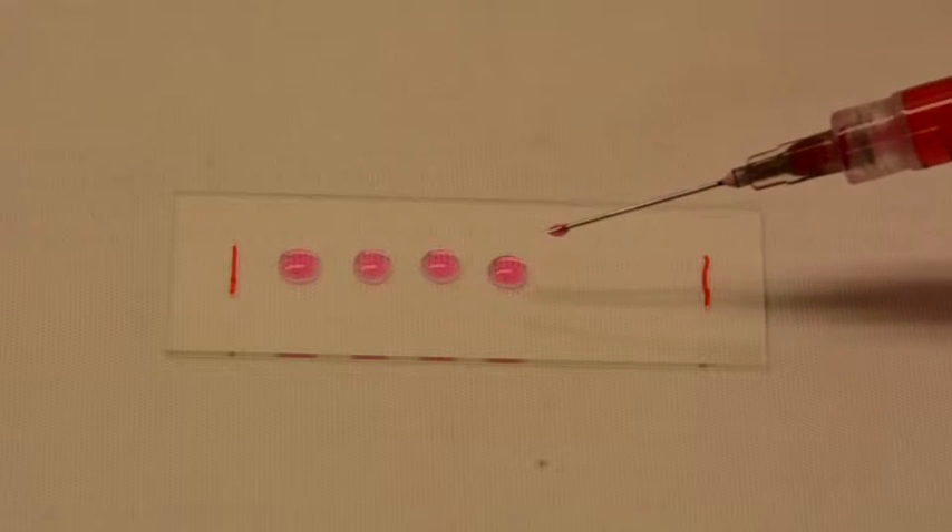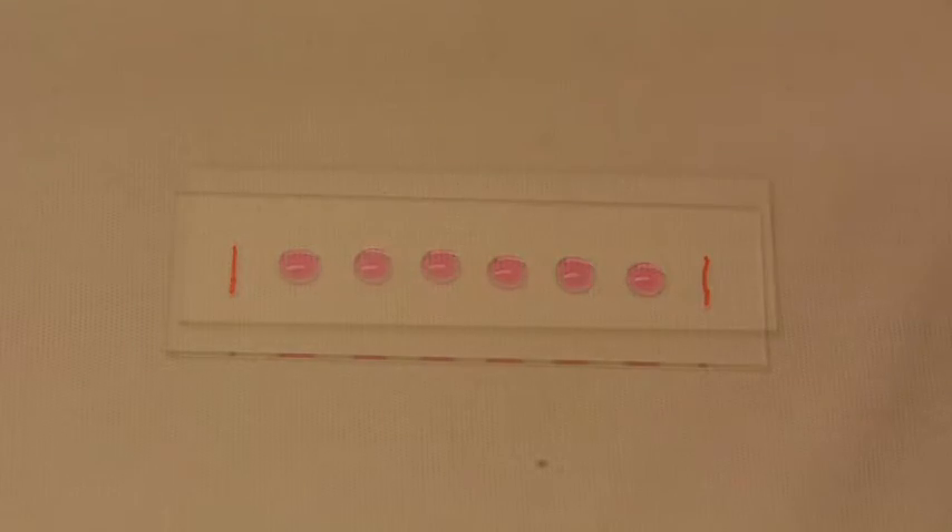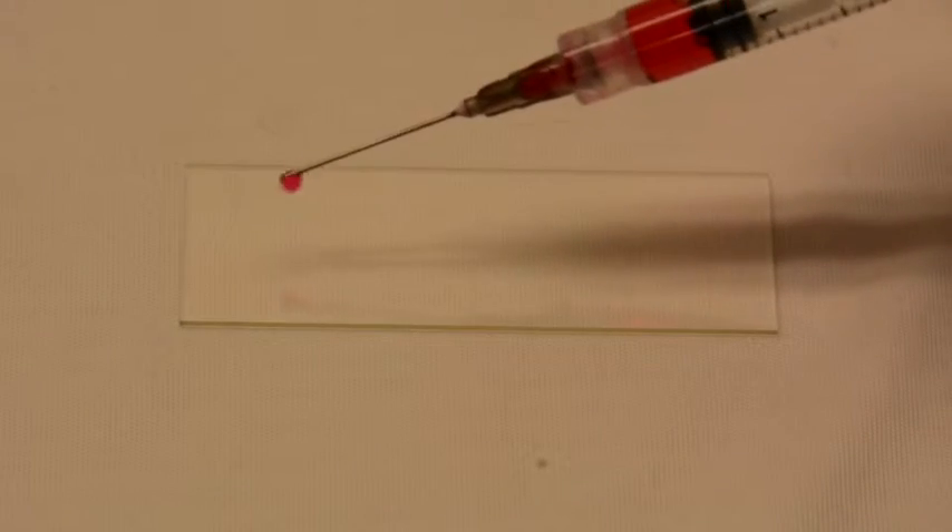Red lines are intentionally added to the glass slides to show the surface contamination cleaning effect. After the plasma treatment, the red markers have been totally removed.